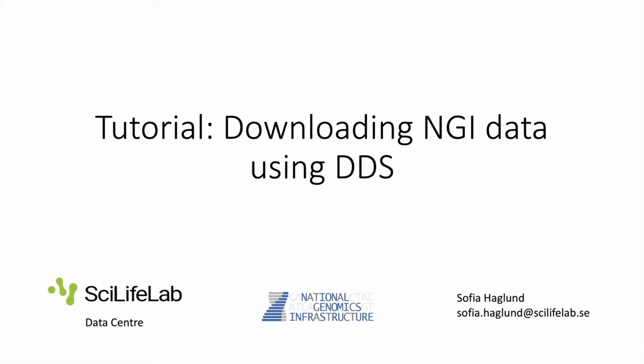Hello and welcome to this tutorial video demonstrating how to download your NGI sequencing data using the DDS system. DDS is a command line tool developed by the data center at SciLife Lab together with NGI. It consists of a command line interface and a web interface.